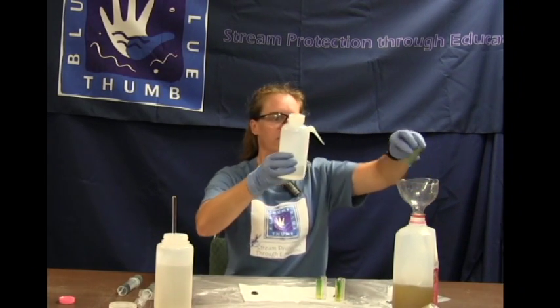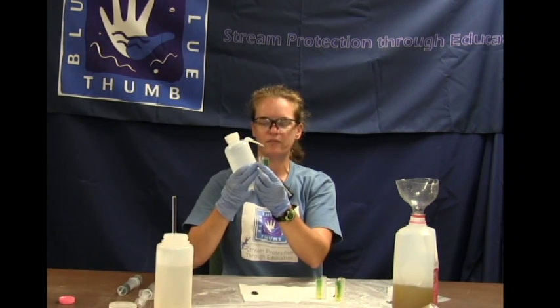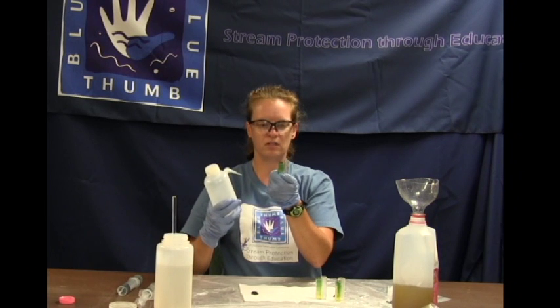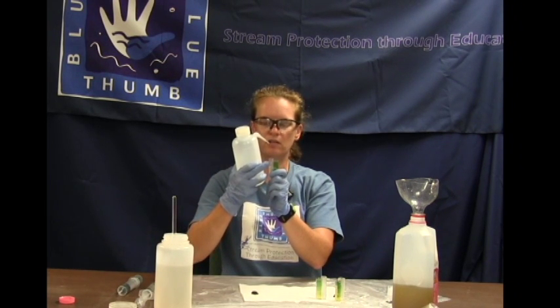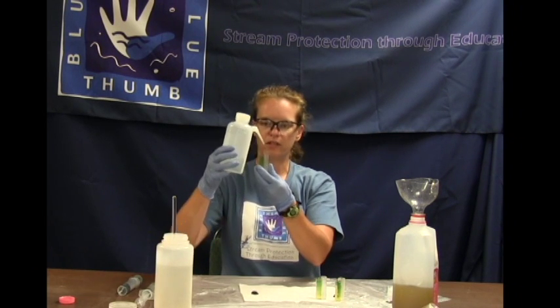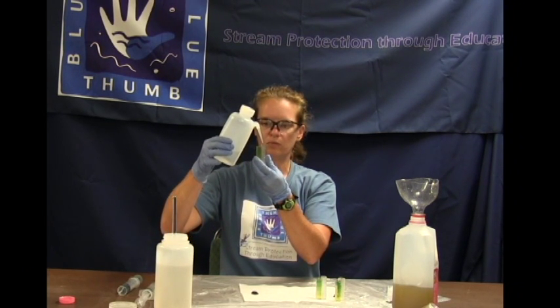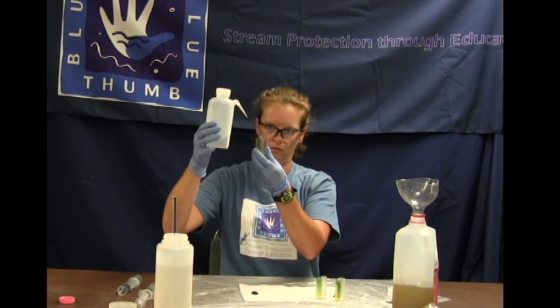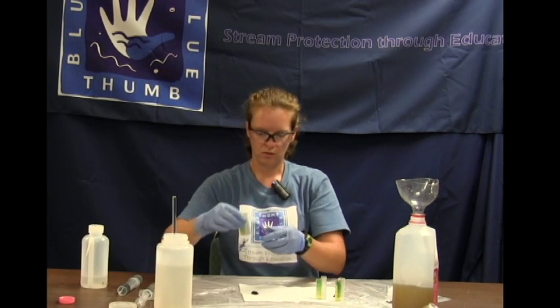And your fill line on the cube is going to be on the left-hand side, the clear side, where it has some numbers on there, and then it says milligrams per liter, and then there's a small dashed line. That's going to be your fill line. So the blank gets filled with deionized water up to that dashed line on the left. You want the very bottom of the water curve to be at the top of that line. Fill it eye level. So that's our blank.